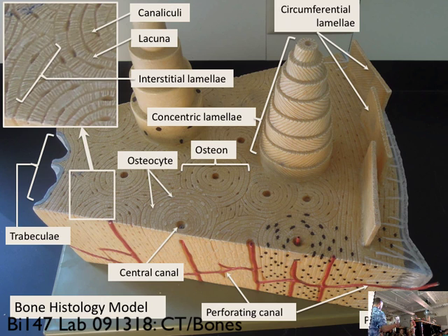So all of the osteocytes are just bathing in it. They're just bathing in the blood, which is great because they get all the nutrients they need. They get all the oxygen they need. See the concentric lamella, they sort of pull an osteon out. So it's just showing the crossing fiber pattern in the concentric lamella.